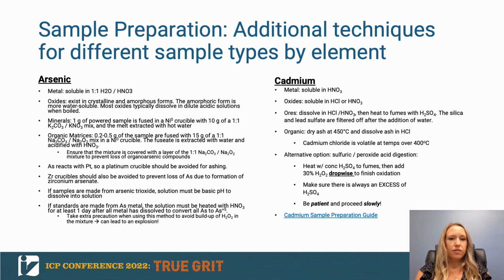And we also have sample preparation guides available on our website that you can refer to by clicking on the links at the bottom of each element that are going to give you some really good tips and preparation techniques for each specific sample type.